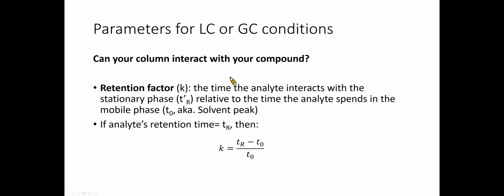A compound with a weak column interaction could be easily interfered with by the co-eluted matrices and salts, where severe ion suppression may be observed in the LC mass analysis. However, the analytical runtime would be too long if the analyte-column interactions were too strong.